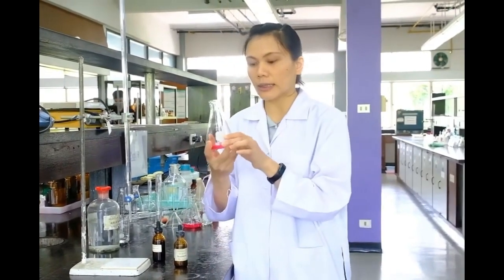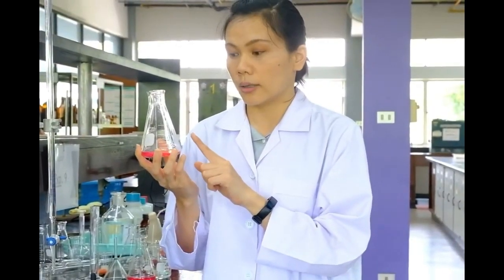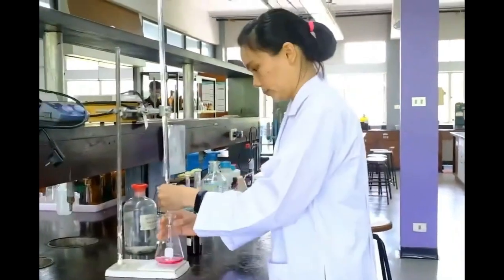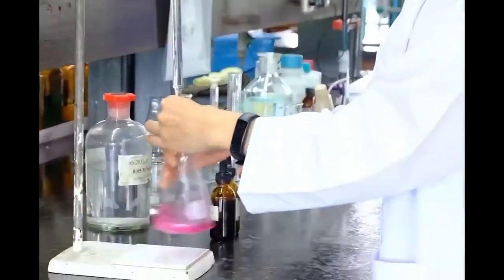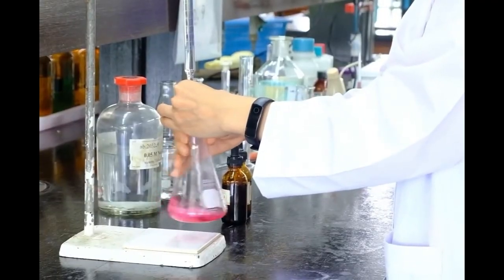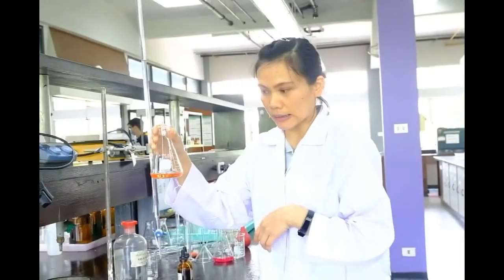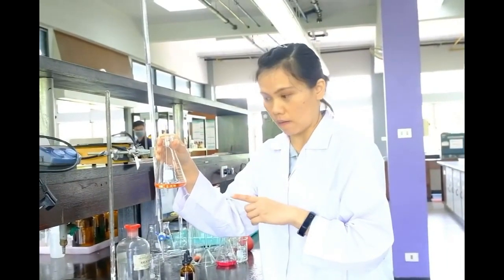Actually, phenolphthalein is colorless in an acidic environment. Since the initial solution already has the orange color from the methyl red, continue titrating with sodium hydroxide. This will initially produce a yellow color. But, as you continue titrating, you will regain the orange color, which is the second endpoint.